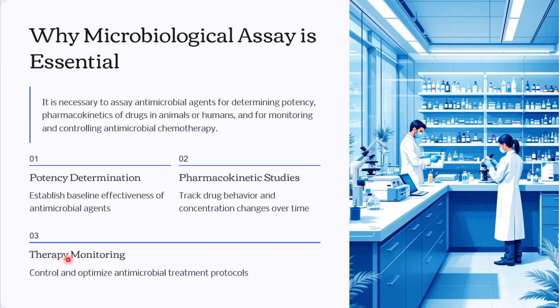And the third one is therapy monitoring, to control and optimize antimicrobial treatment protocols. So these are the needs of microbiological assay: potency determination, pharmacokinetic studies, and therapeutic monitoring.